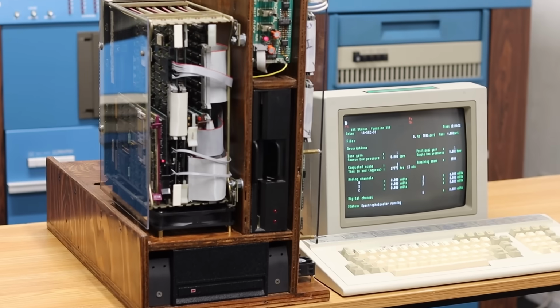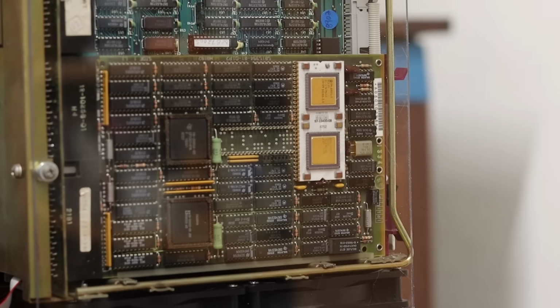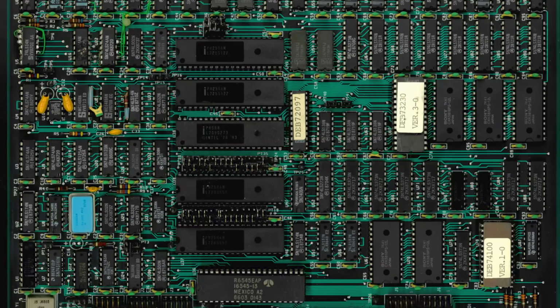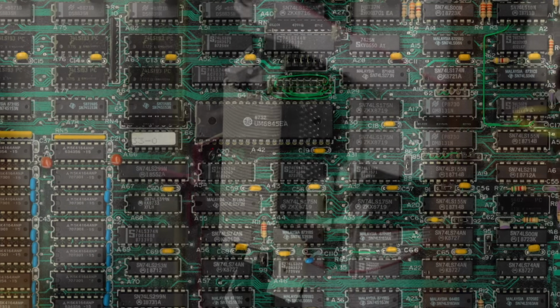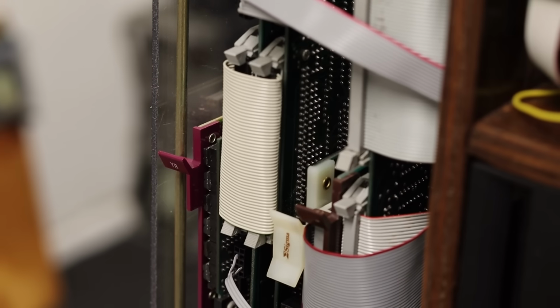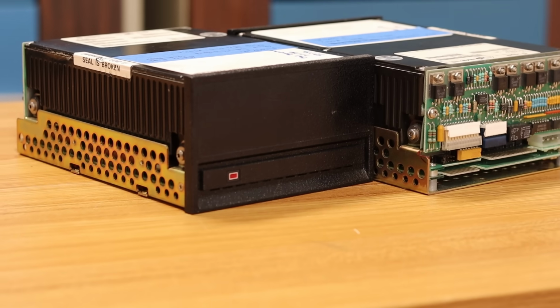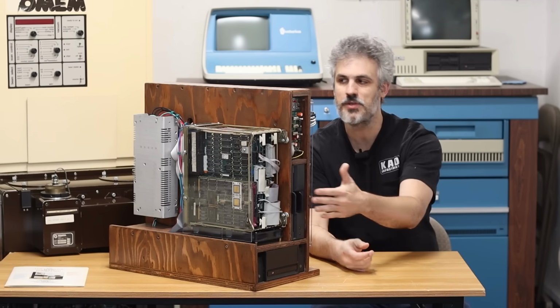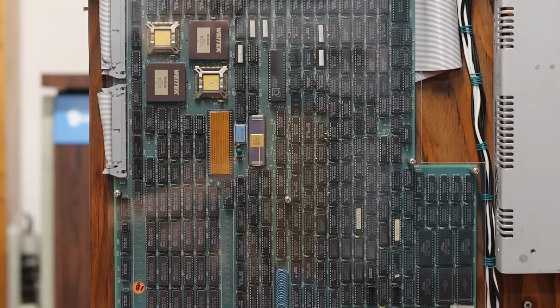In this admittedly unconventional case, there is a PDP 1173, 2 megabytes of memory, a Bomem DEB41 paired with a Matrox QRGB that give us the full color graphic capabilities, the Bomem DEB18 that interfaces with the vector processor board, and an 8-inch floppy controller as well as a Winchester drive controller. On the front here we have our 70 megabyte Winchester drive and our 8-inch floppy drive, and then on this side here we have the high performance vector processor.